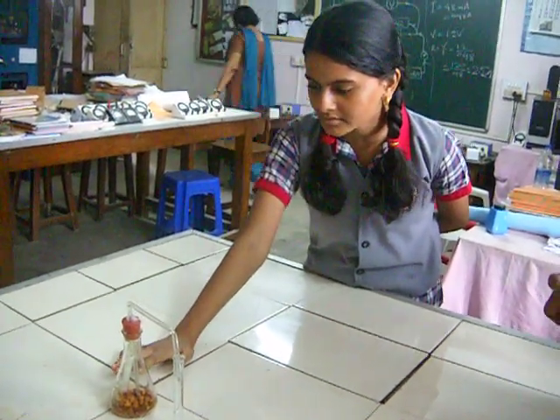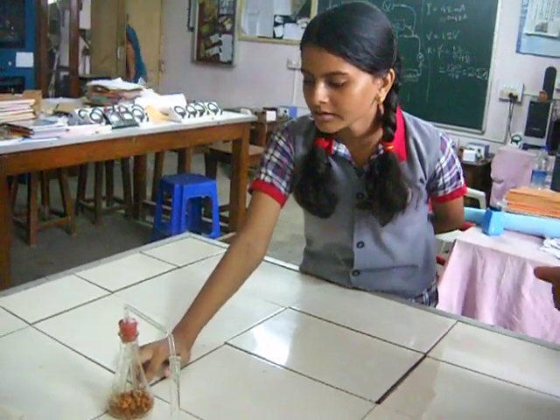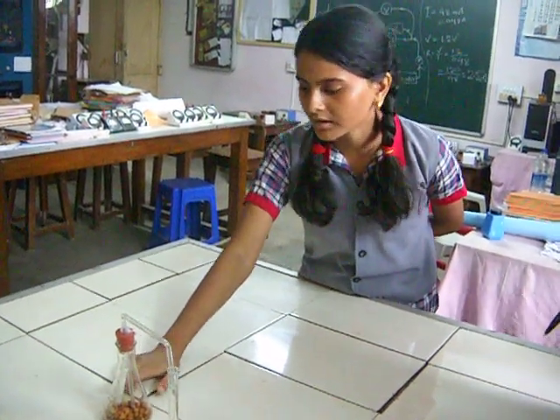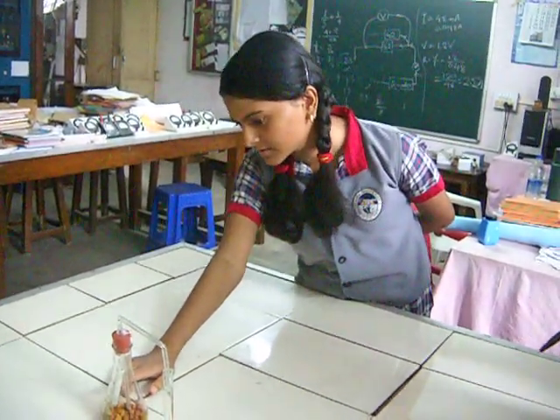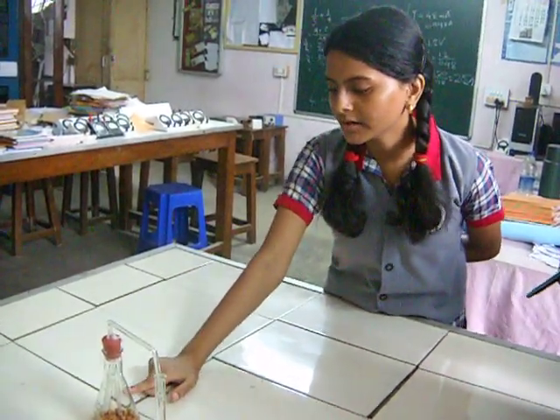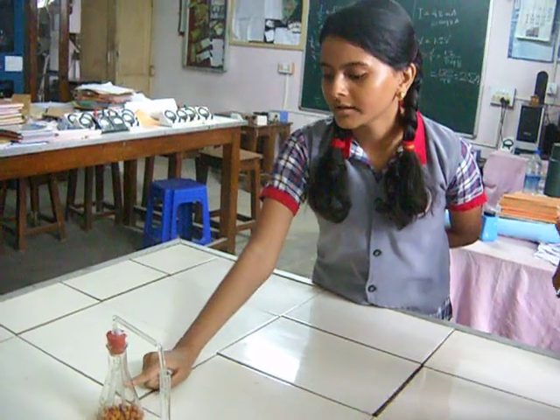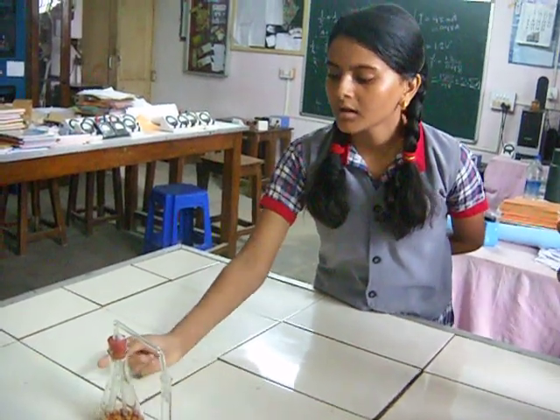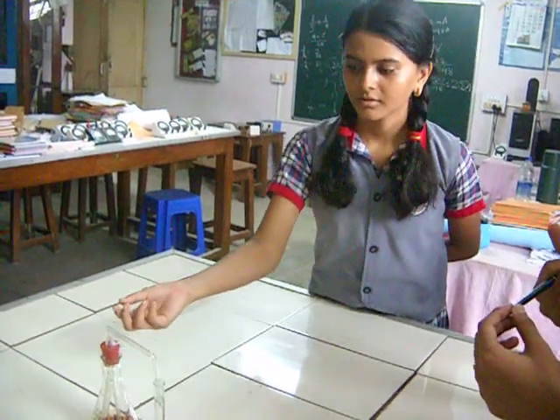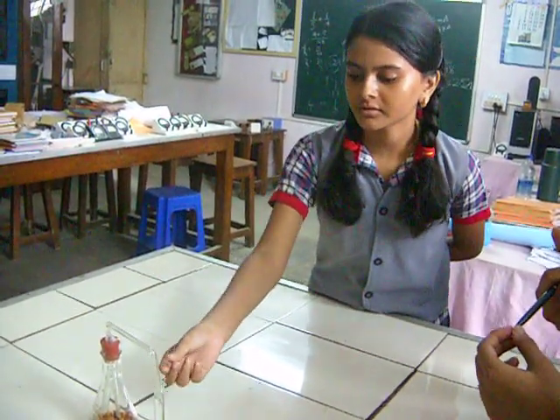This is the KOH test tube in which the carbon dioxide is getting directed into this test tube. In this conical flask, a back vacuum is being created through which it will help the gas to enter through the stretching tube.